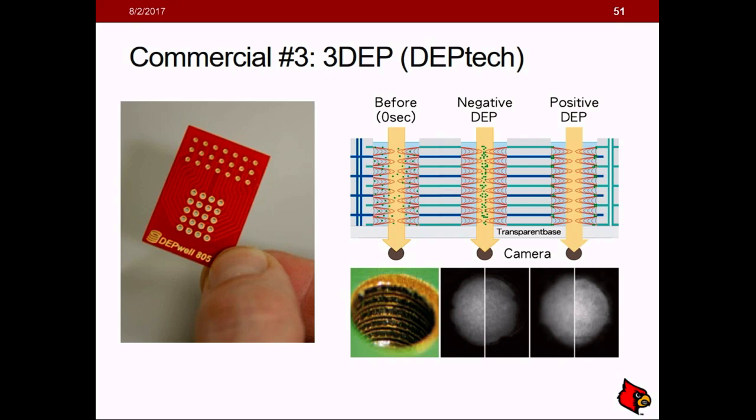You put your cells in your system, say you don't have any knowledge, or you desire knowledge, of their Clausius-Mossotti factor, and at these discrete frequencies you can obtain this data and fit to it. Then maybe you alter your cells in some way, you get a new change in your system, and you can monitor it in this way.